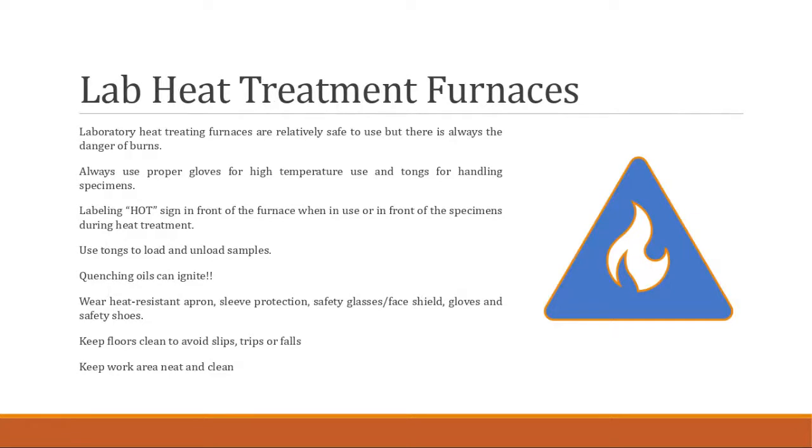Furnaces, though you may not be working with any of these, they are in the lab, so I do bring it to your attention. There might be people in the lab performing quenching techniques and or tempering. So obviously anything hot is going to be designated with hot, or should be designated with hot. You just have to be careful when you see anybody working with our laboratory furnaces.